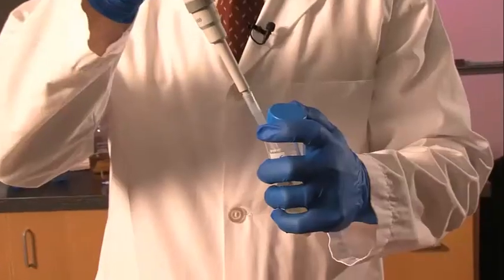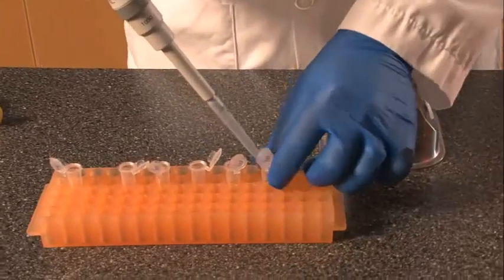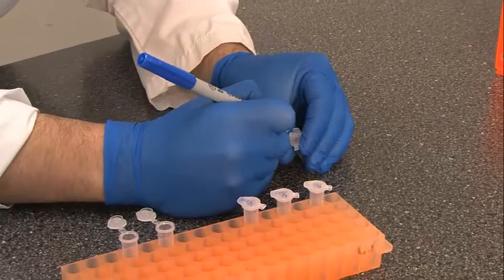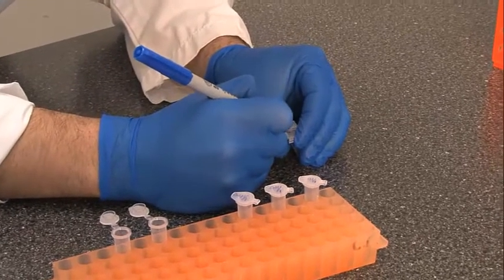What I have here is a sample of unpasteurized milk. And what I'd like to do as a microbiologist is figure out how many bacteria are growing in this sample, as well as the types of bacteria that are growing there. And the way that we can do that is through a process known as colony-forming units.